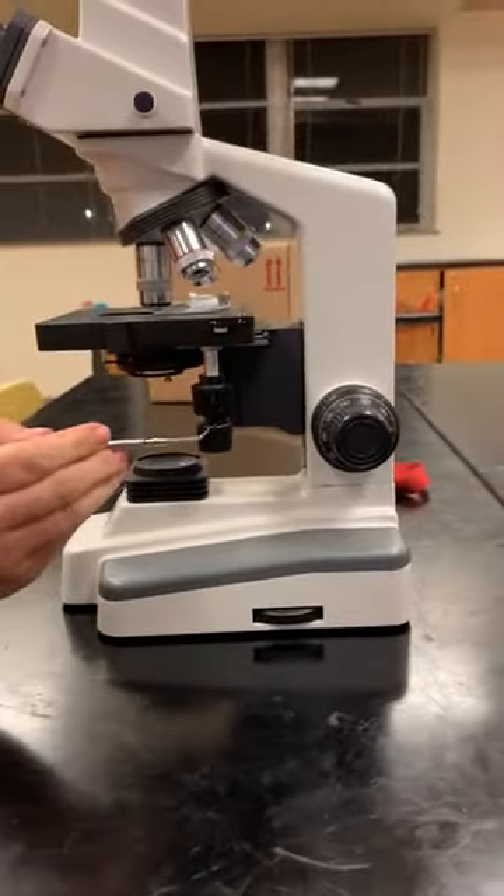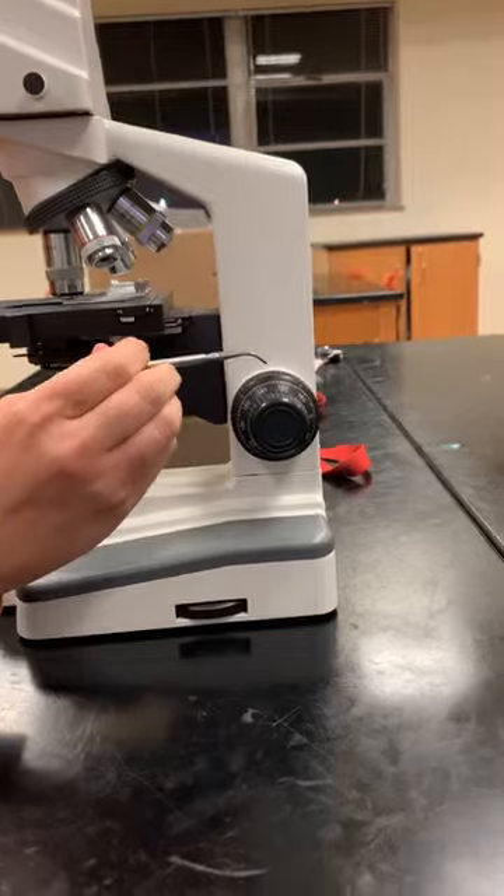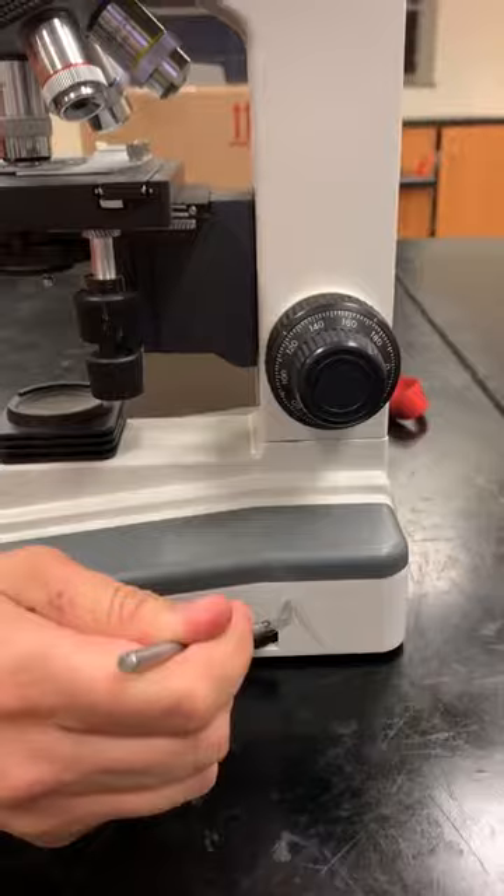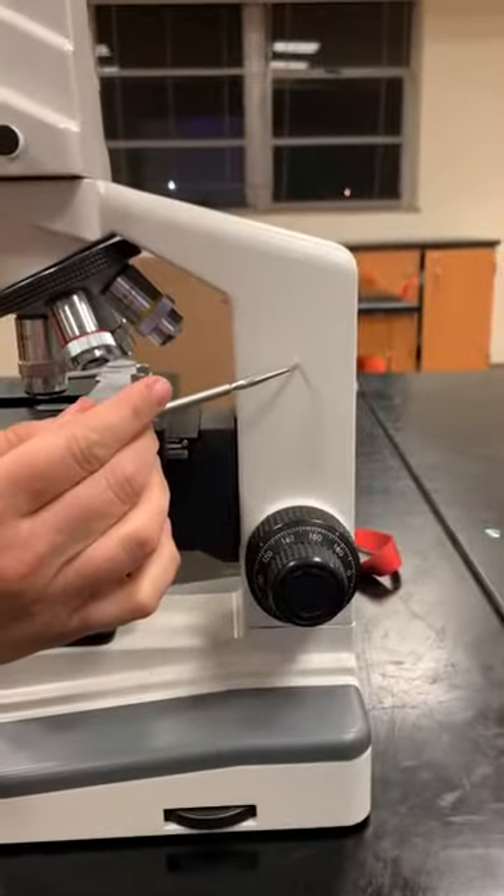You have your x and y knobs, your coarse focus knob, your fine focus knob, your stage, and your arm.